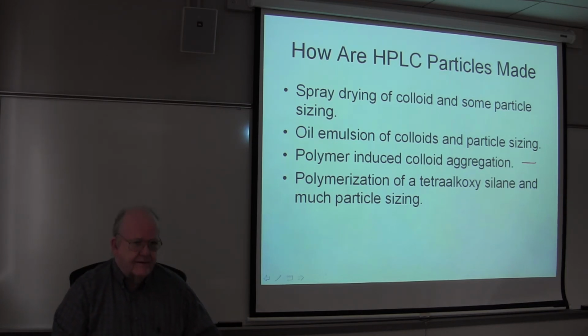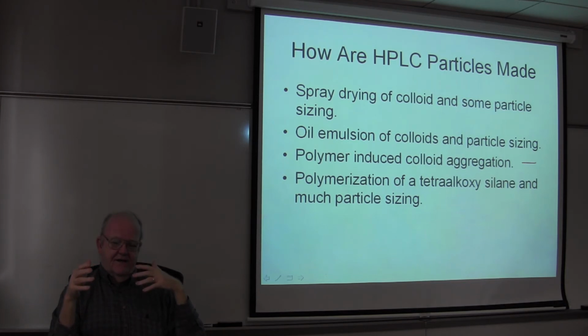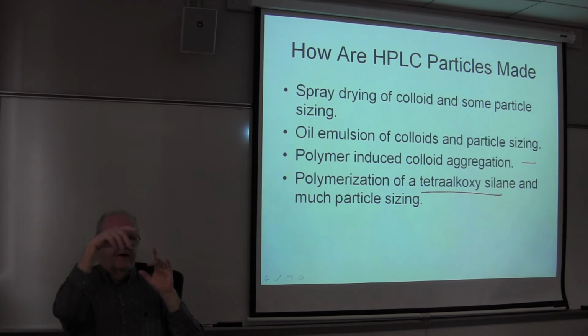And then the final way it's done is to start not with a colloid anymore, but with a soluble material like a tetraalkoxysilane. And you throw that into either water or an organic solvent, and you add acid. And that causes the hydrolysis of the tetraalkoxysilane, and you start forming SiO2s, and the SiO2s all stick together.